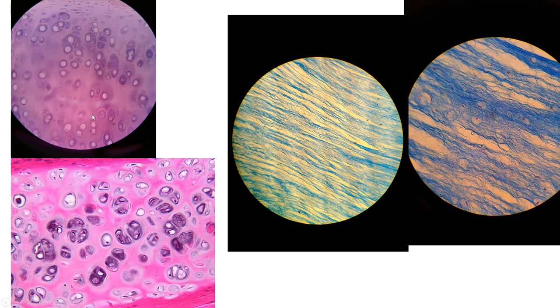This is hyaline cartilage, the most common type of cartilage, also the weakest. It should have a glassy type appearance, so you are seeing the smoothness of it. You shouldn't see any fibers. And these are chondrocytes lying in spaces called lacunae.